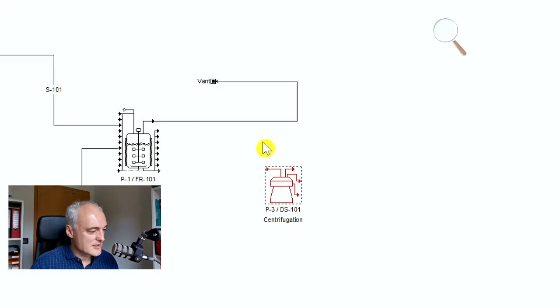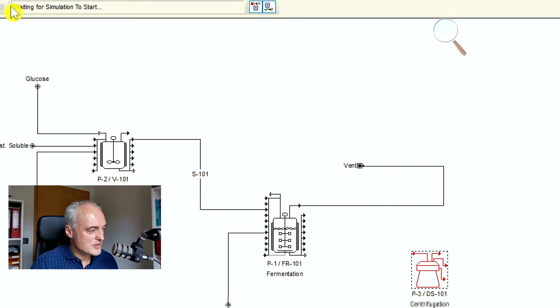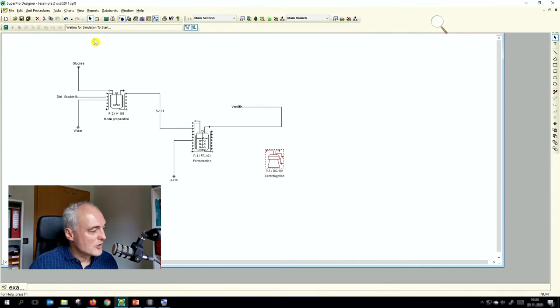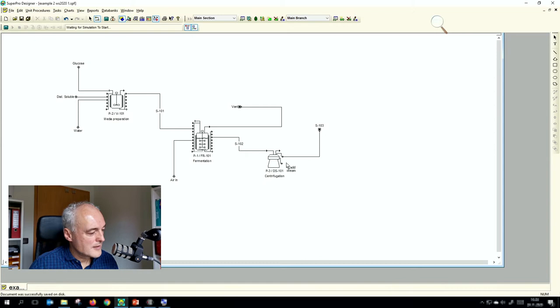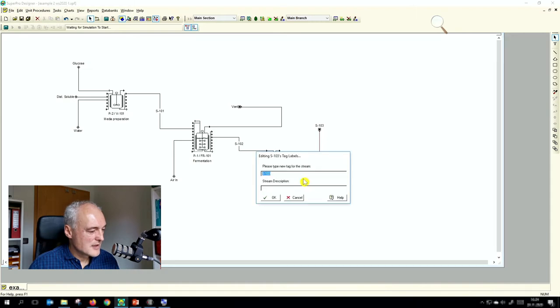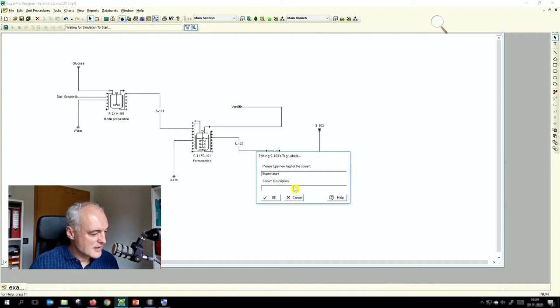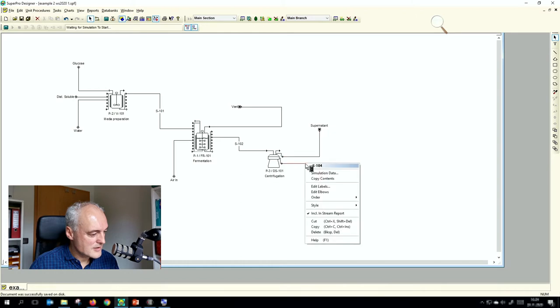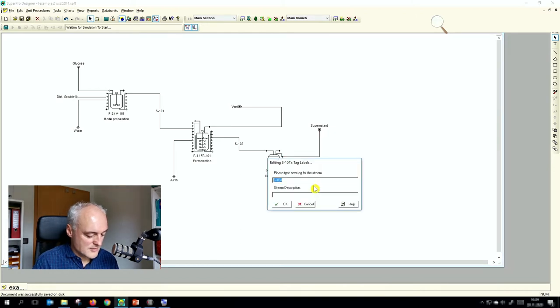Now we connect the streams: first the stream from the bioreactor to the centrifuge, then a supernatant stream, and then our product stream. I immediately annotate the streams — Edit Labels — this one is 'supernatant' and the other stream is 'yeast product'.